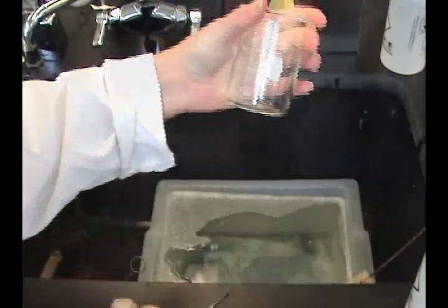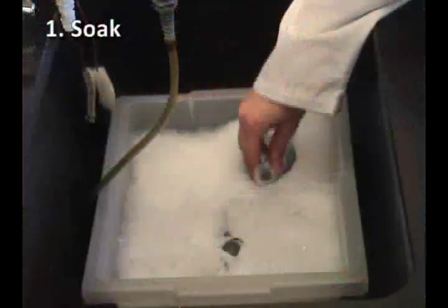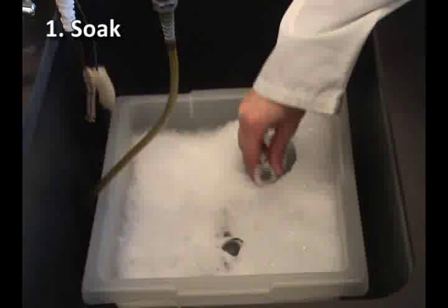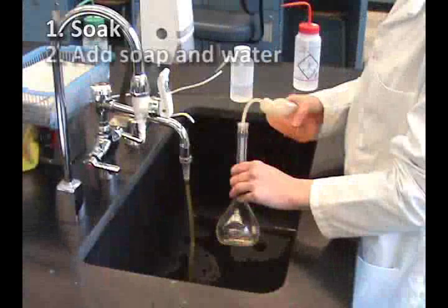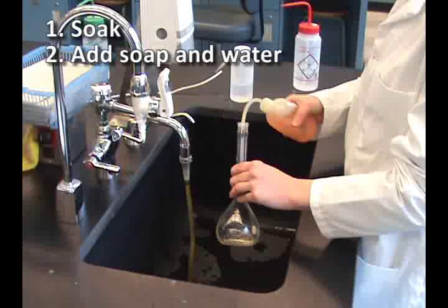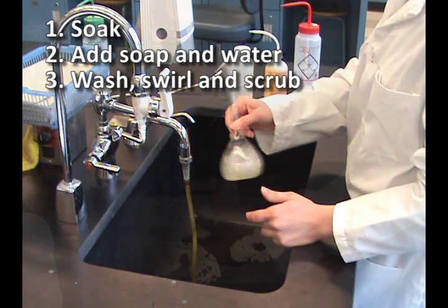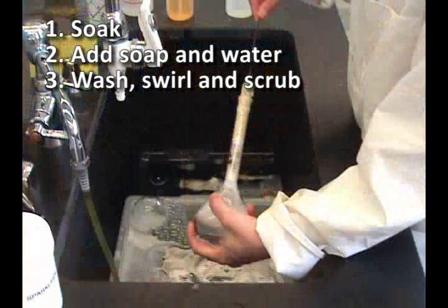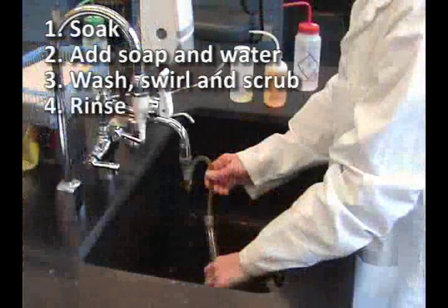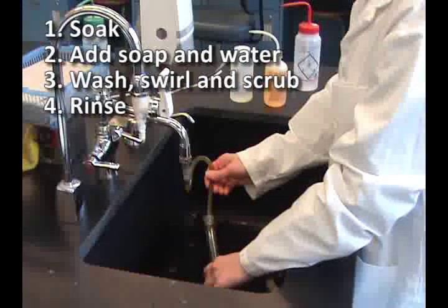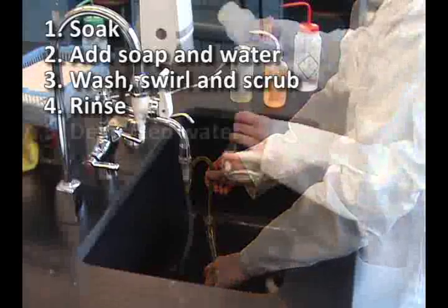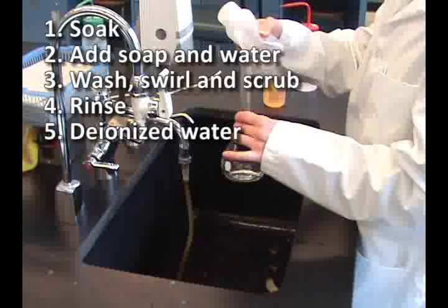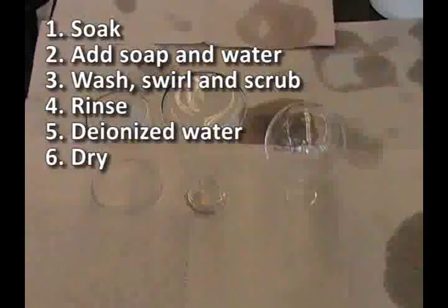Let's review the steps. Soak in SparClean. Add soap and water. Wash, swirl and scrub if needed. Rinse well with tap water. Use deionized water for final rinse. Dry. Now you have clean glassware for experiments.